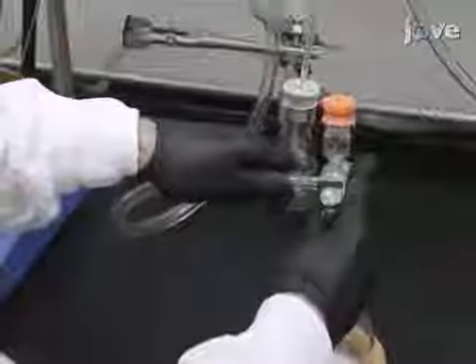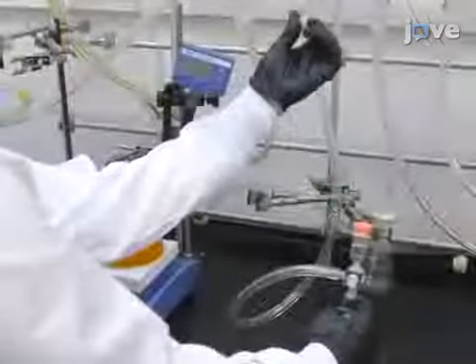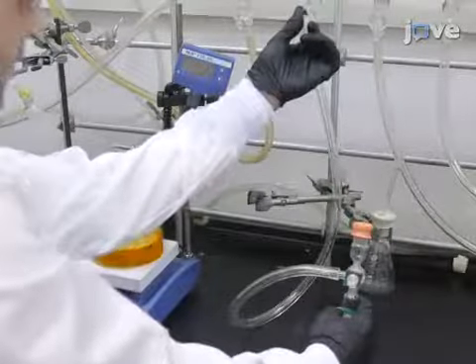Connect the flask to the manifold and purge the flask for 2 to 3 minutes with argon. Turn the valve to the vacuum position to purge the flask.